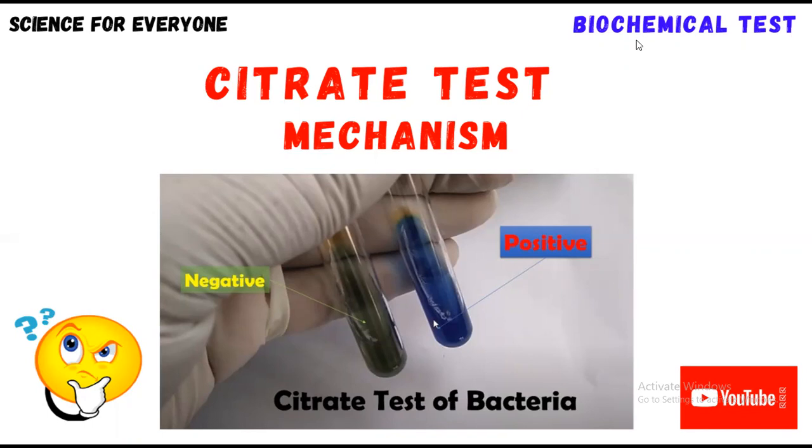So in today's lecture, I will discuss the different steps involved in the preparation of the citrate media, and I will also discuss the basic principle of it, why we are conducting it, and at the last I will show you the different chemical reactions that take place inside the tubes. That part is very important for microbiology students, because knowing about the chemical reactions is very important. So let's start with the video lecture.